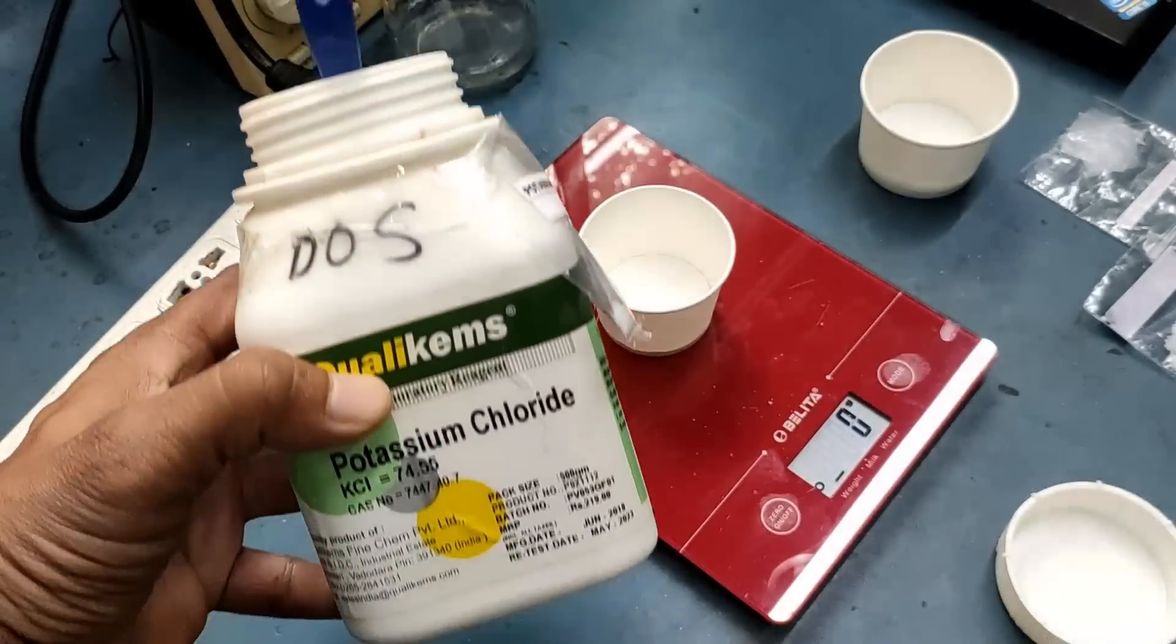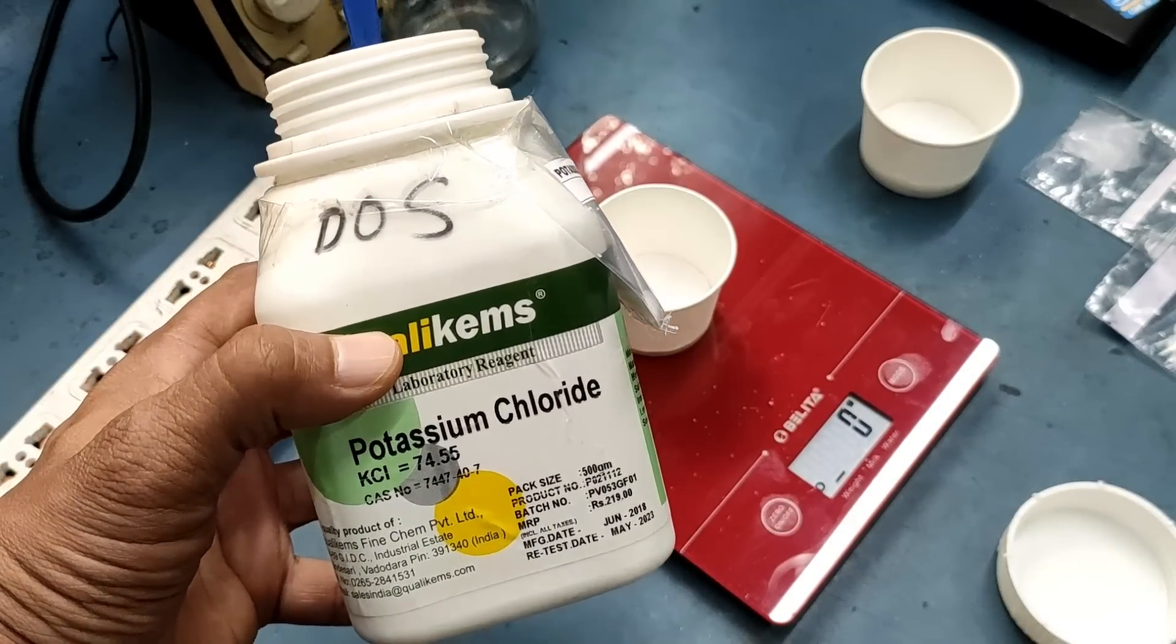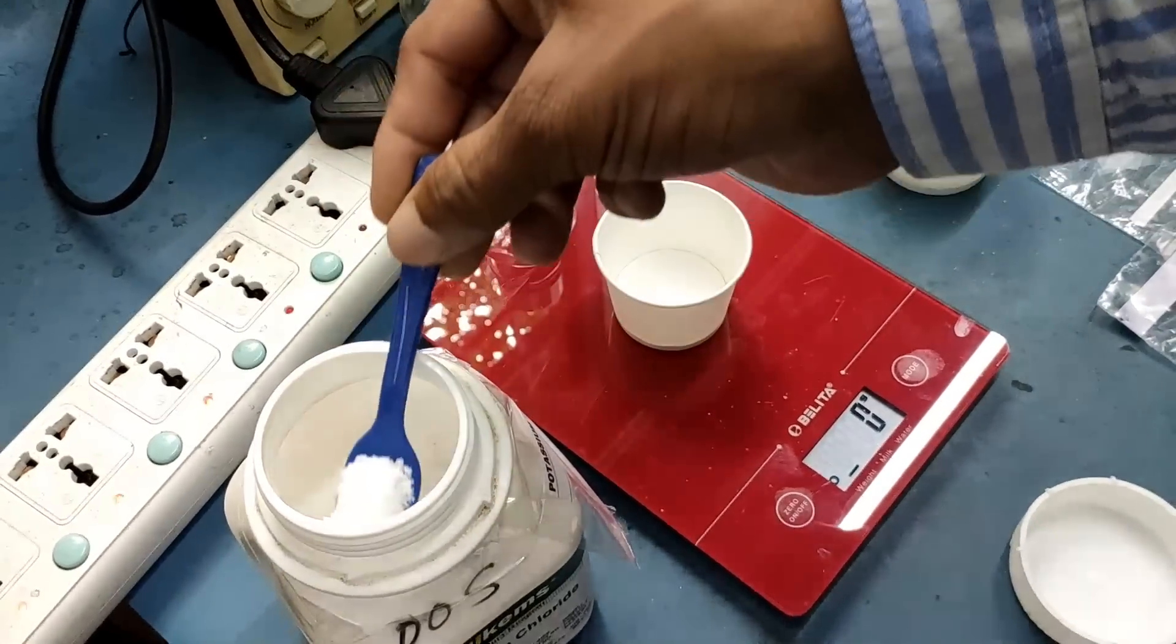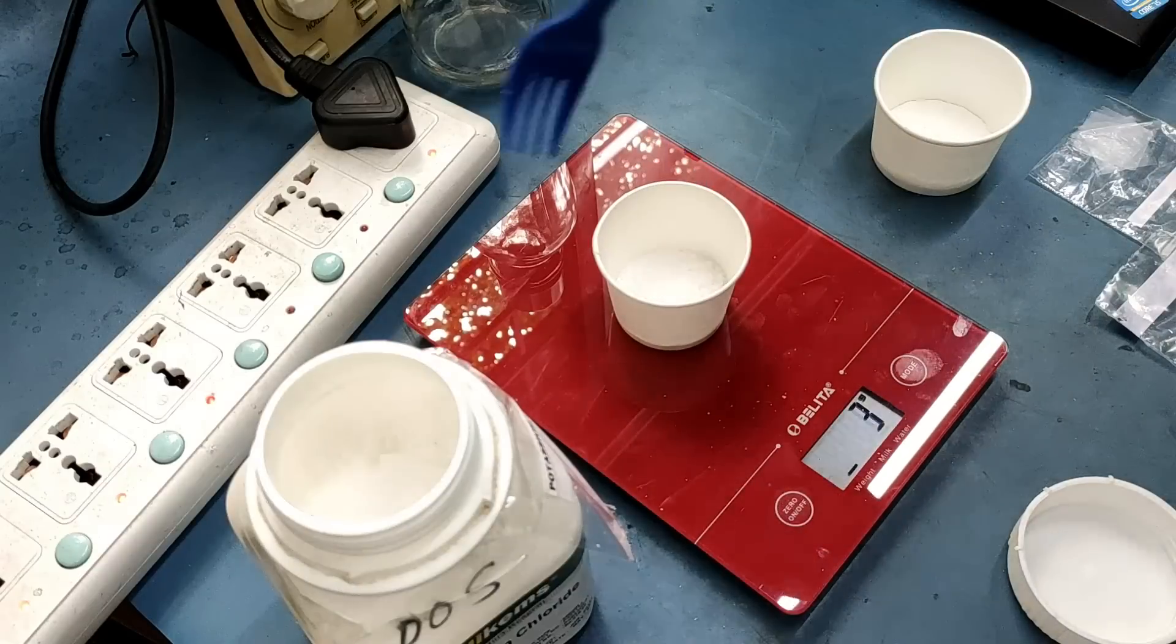Before getting the dissolved oxygen sensor probe to work, we need to prepare the probe by dissolving the KCL crystals of approximately 2 grams with 26 grams of water.